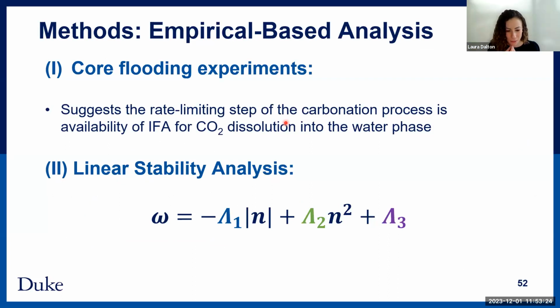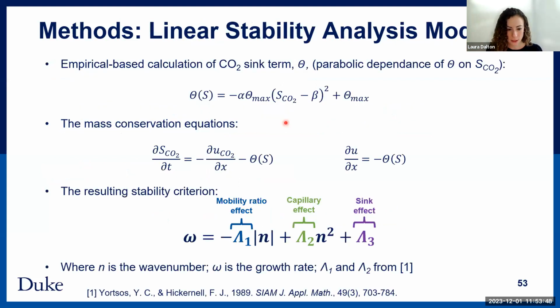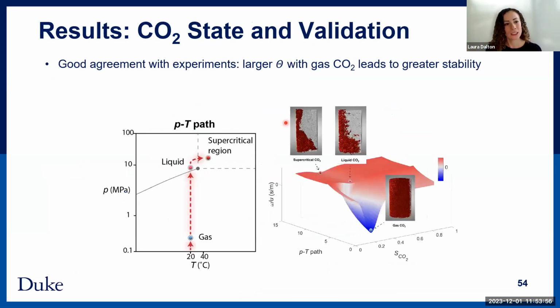So the first thing I've had my postdoc do is take that data, and he's developing a model, running a linear stability analysis using the reaction rates we have, because when we run these experiments, we also have LabVIEW data that's monitoring the pumps that we're using to flow through the system. So we can use all this and calculate reaction rates. I'm not going to get too much into this, but he's very much the model expert, and he's working on this right now. But he's had very good agreement with our results so far.